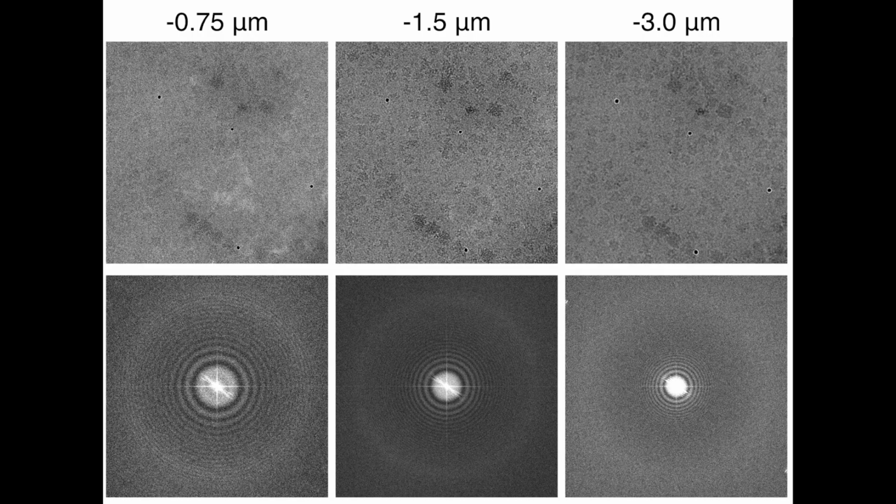And it's not really good for us when we're trying to spot stuff that's in the sample, but it's also really good because at that focal point you have the cleanest amount of electrons going through, and the cleanest electron scattering going on. But if you want to pick out particles that you think are interesting and want to look at further, you can't even pick out any particles because there's no contrast in the image.